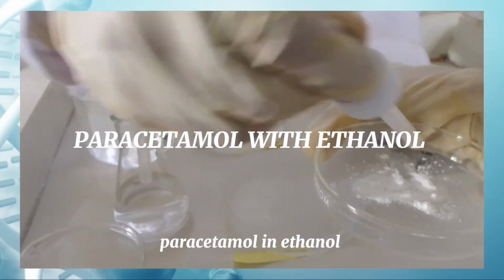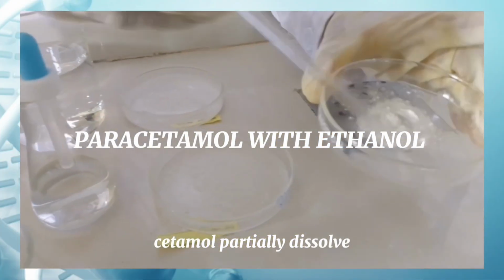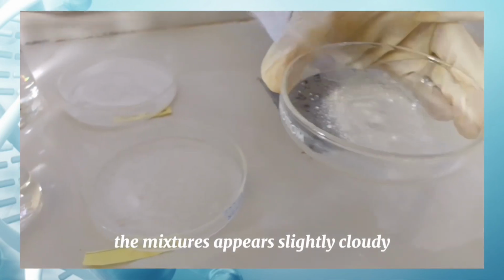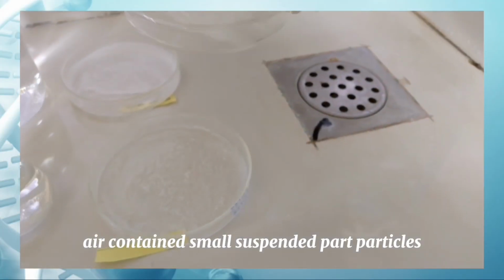Paracetamol and ethanol. When mixed with ethanol, paracetamol partially dissolves, but some particles remain visible. The mixture appears slightly cloudy or contains small suspended particles.